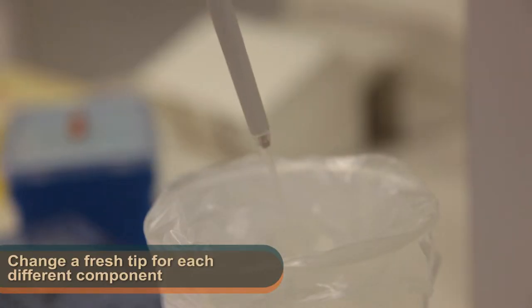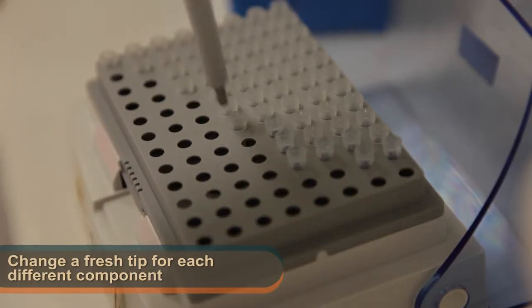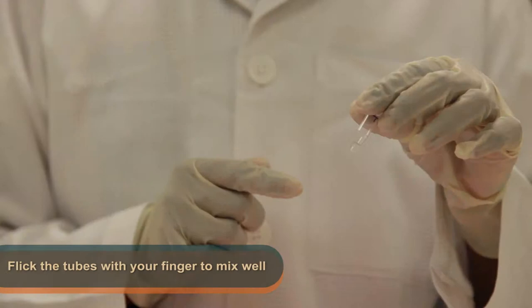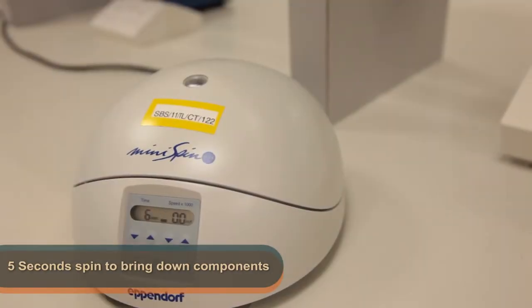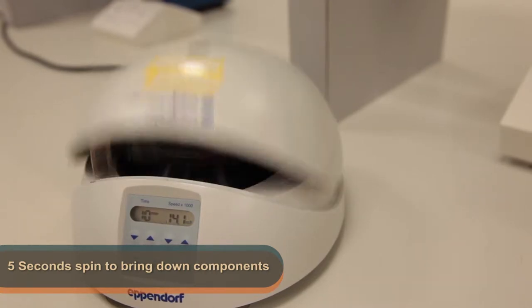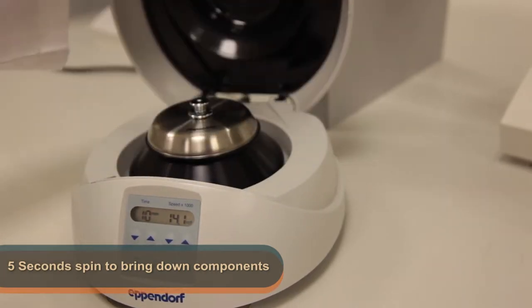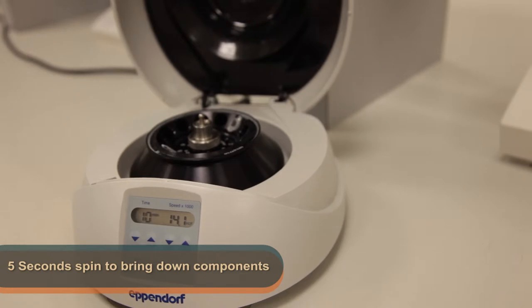When adding different components, do use a fresh tip to avoid any contamination. Flick the tubes with your fingers to mix the reagents and perform a five-second short spin to bring the components down to the bottom of the tube. Do try to prevent any formation of bubbles.